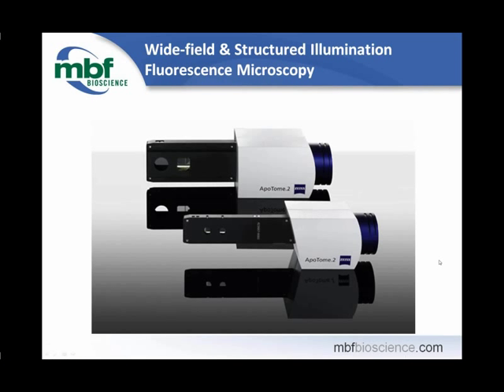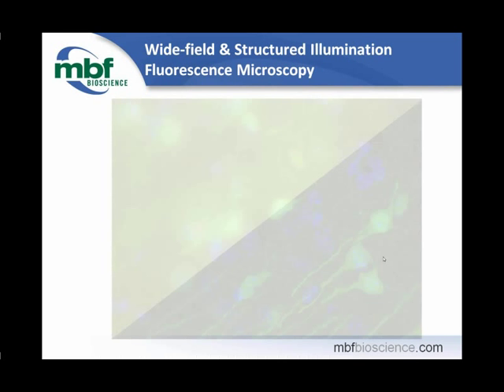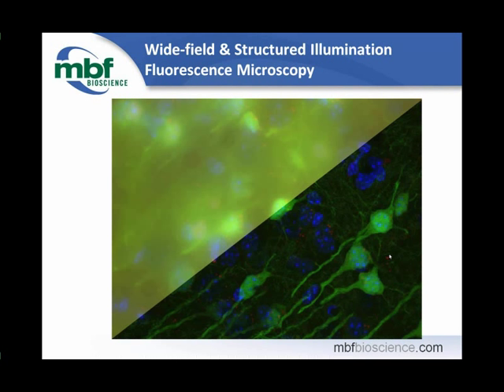To this end, we've also integrated the use of structured illumination devices, such as the Apotome 1 and 2. The Apotome operates by removing out-of-focus light through an algorithmic process and the application of shadows onto your tissue. The differences can be quite remarkable.